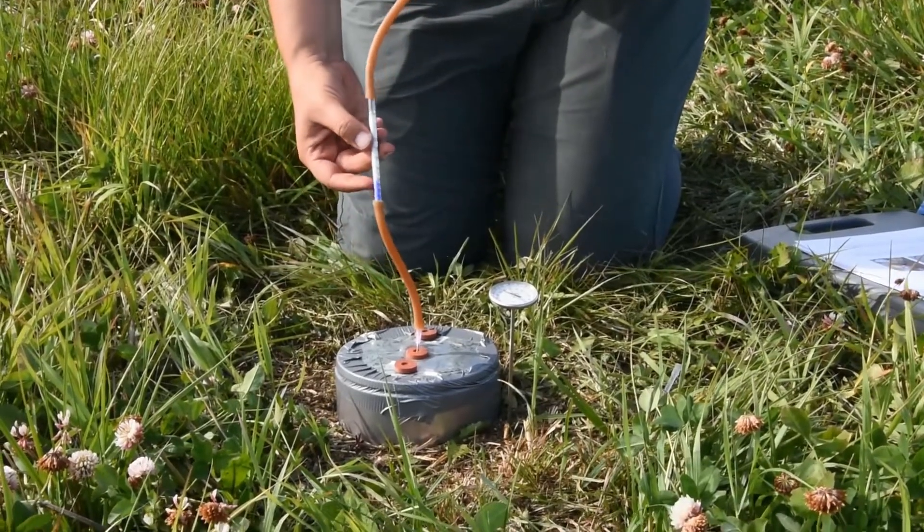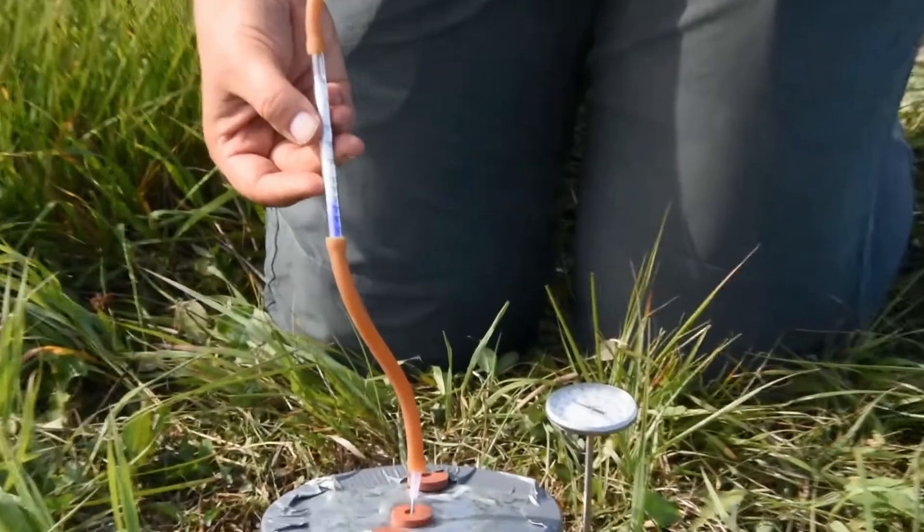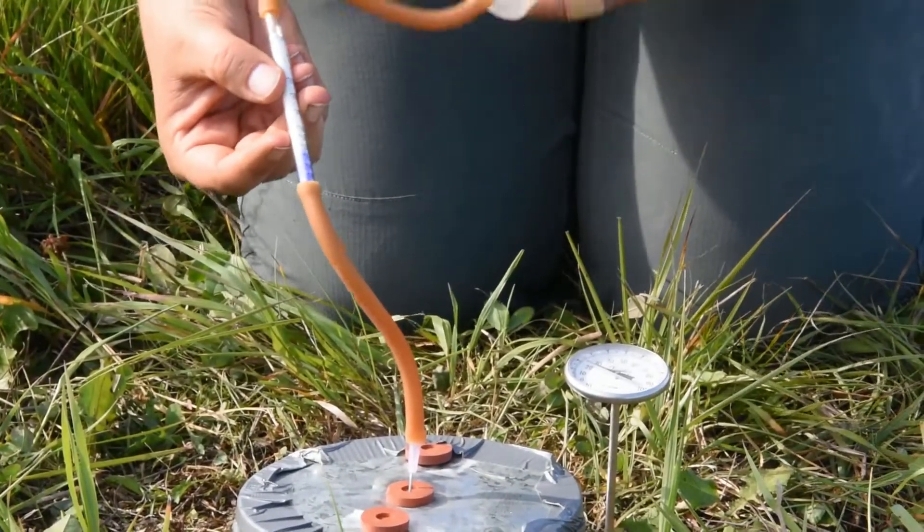You'll see that as air has moved through the Draeger tube, it has turned blue. That's indicating the level of CO2 expired.